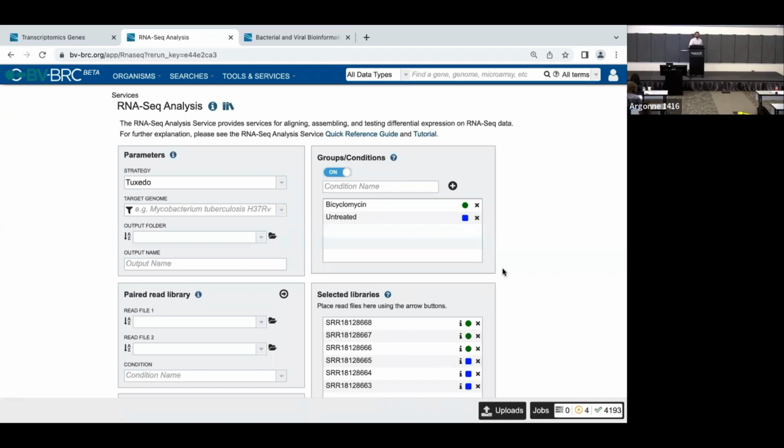The other place that can be useful is, remember the variation surveys example that Rebecca showed, where you are using the same input data, the same conditions and everything, but you want to just do the assembly or variation analysis using different algorithms. In that case also, you don't need to keep going through all the steps again. You can just press the rerun button, come here, use a different algorithm, just change that part and then resubmit the job.